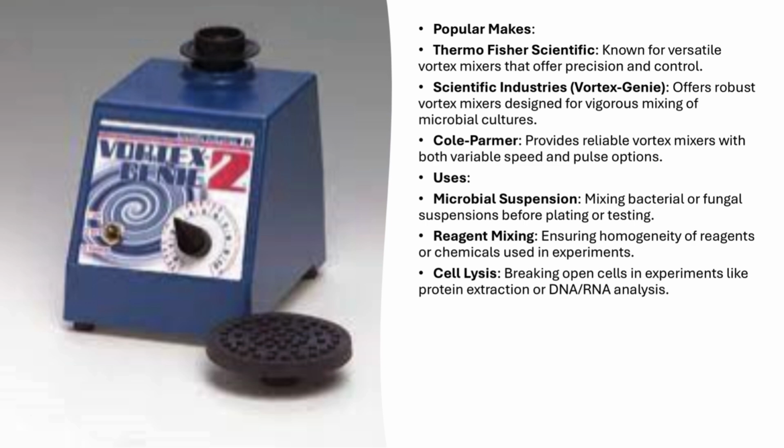Cell lysis. For applications that involve protein extraction or DNA/RNA analysis, vortex mixers can help with cell lysis, or breaking open cells to release their contents. The vigorous mixing ensures that the cell membrane is effectively disrupted, allowing for the efficient extraction of cellular materials.